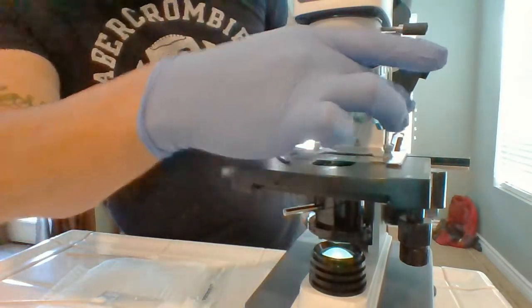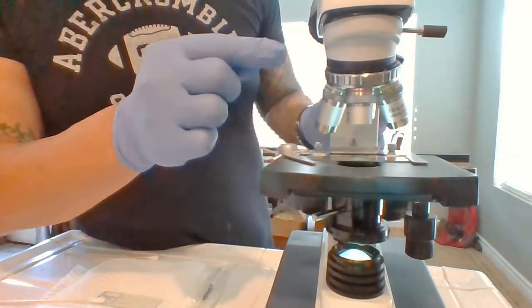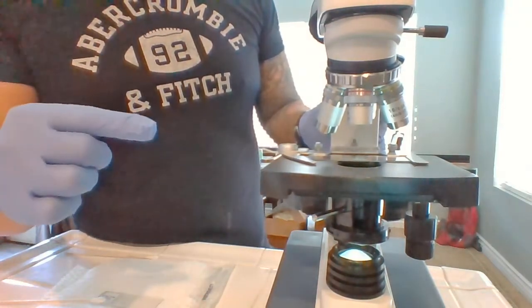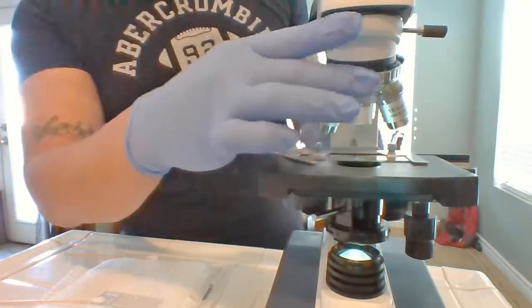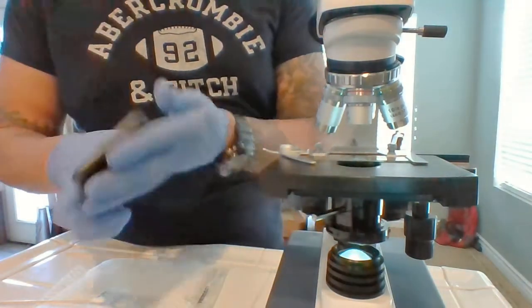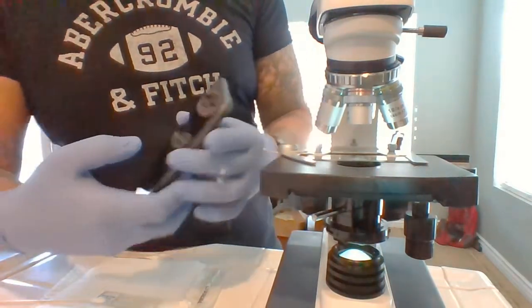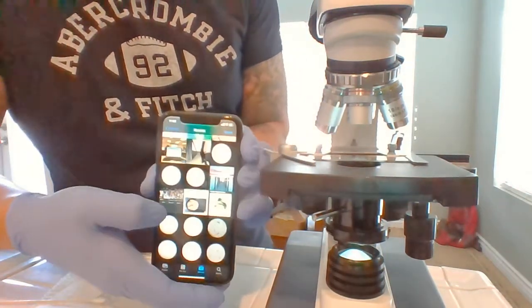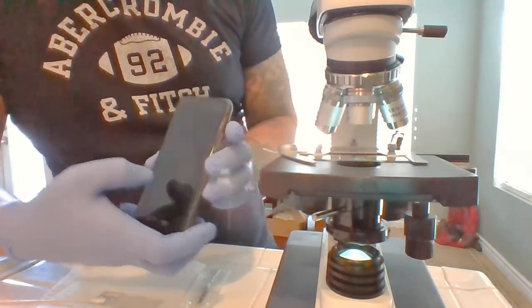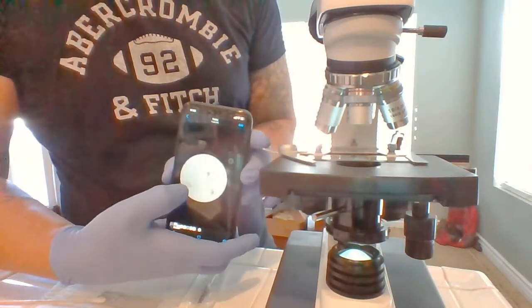And obviously you want to start again at the lowest magnification. It can be observed in the same way as the slide I previously showed you in the video. I will do the same steps for each observation using the objective lens. And for video purposes, I've already taken pictures of the slides of the cells. That was the first, and the third one there.